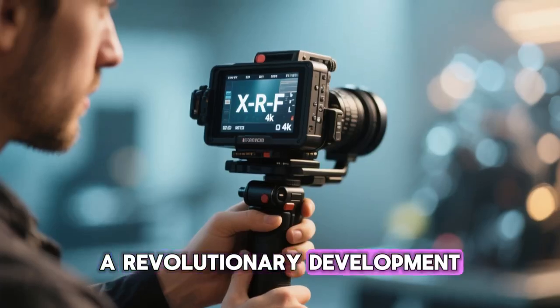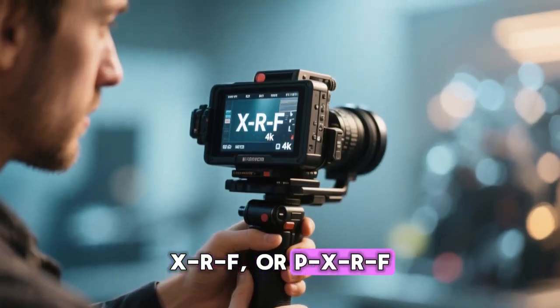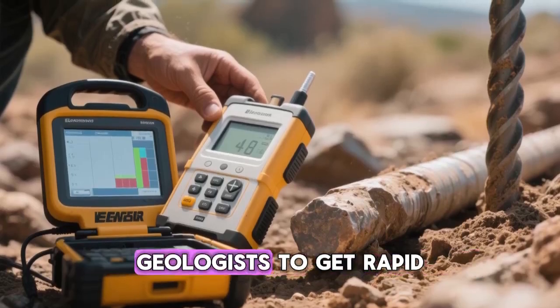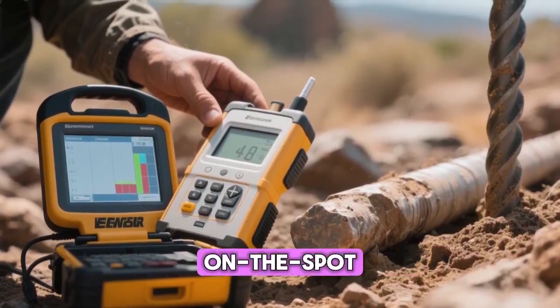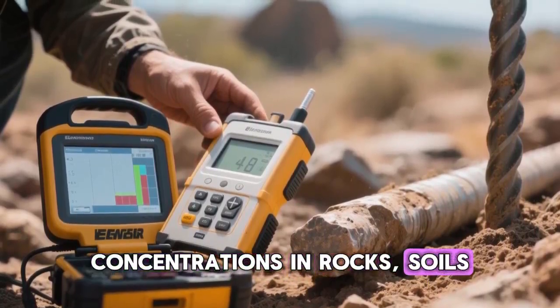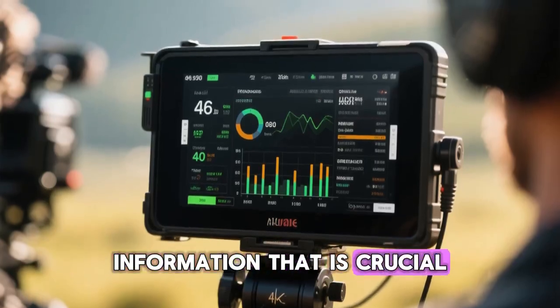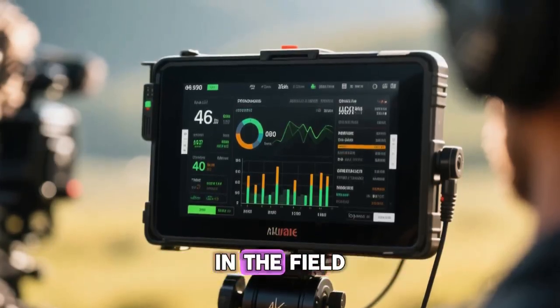A revolutionary development in this area is the handheld XRF, or PXRF. These portable analyzers allow geologists to get rapid, on-the-spot evaluations of element concentrations in rocks, soils, and drill cores. This provides immediate information that is crucial for making fast decisions right there in the field.